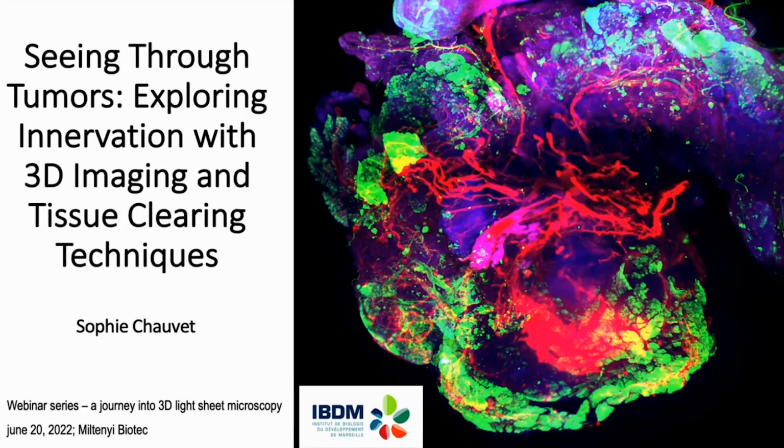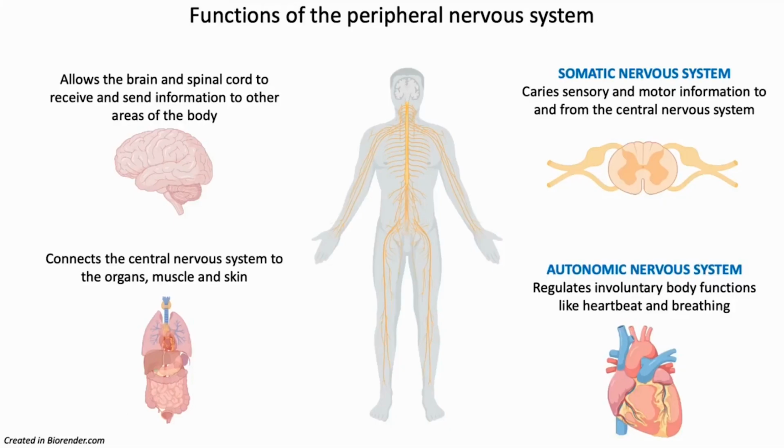Hello everyone, I'm delighted to have the opportunity to share our work in this webinar series organized by Miltenyi Biotec. Today, I will show you how tissue clearing and light sheet microscopy helped us to better understand the importance of innervation in tumor progression. In the team, we focused on understanding the importance of the peripheral nervous system within solid tumor. What is the peripheral nervous system?